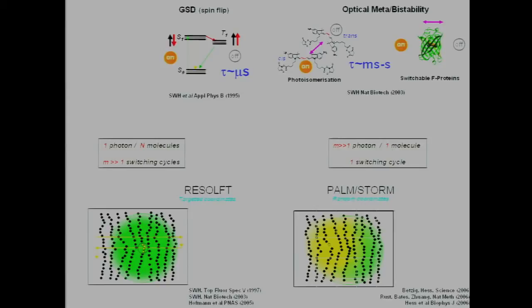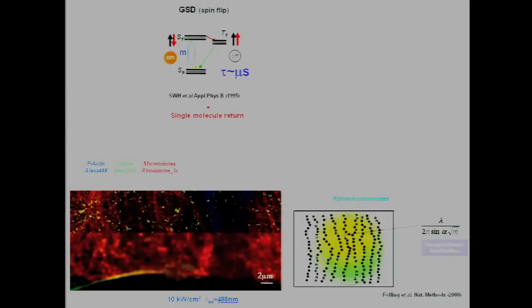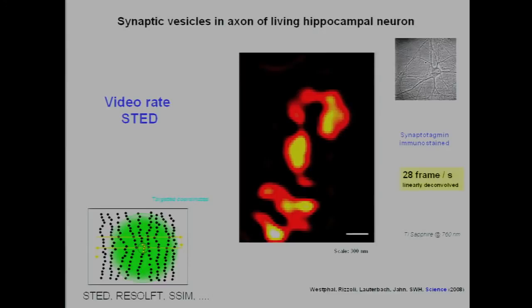But the way the on-off requirement works here is different to here, because here you need only one switching cycle to make an image. So this is a major strength of the stochastic concept, whereas in here you need many switching cycles. On the other hand, conversely, here you need many photons to find out where it is. Here one photon is enough. So each one clearly has strengths and weaknesses, and different areas of application. With the stochastic method, you can get very sharp images, very crisp. With the deterministic method, like the STED method, you can quickly image moving objects, because you already have the information where the photons come from.